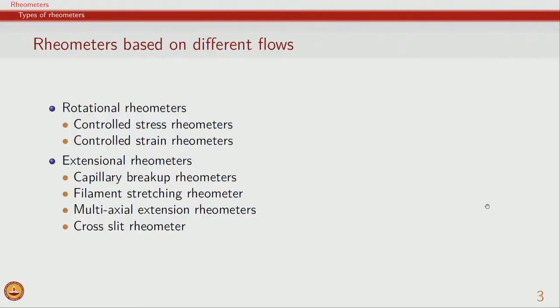From there on, of course, the instruments have become better and better, because our control systems, electronics and control systems have improved over the years. So, extensional rheometers are now more common compared to earlier, but it is still a far more expert domain compared to shear rheology, which is used even by not so keen experts of rheology. In this also there are different methods. The first method, for example, is a capillary breakup rheometer.